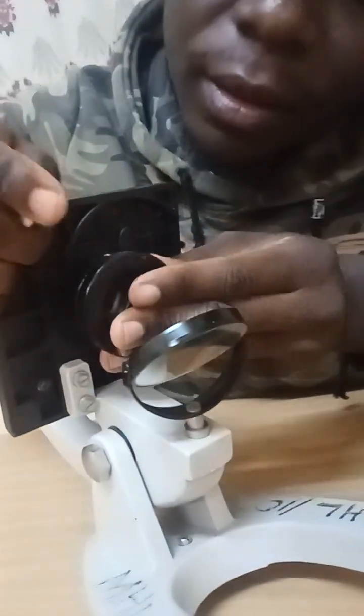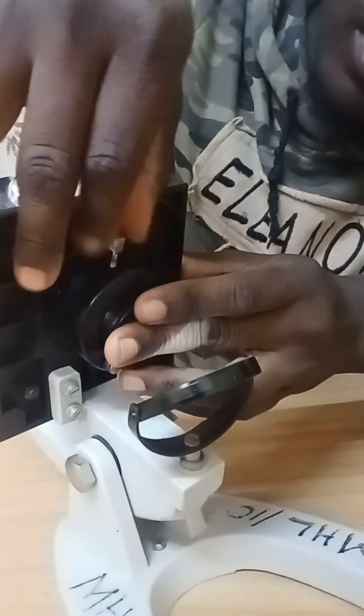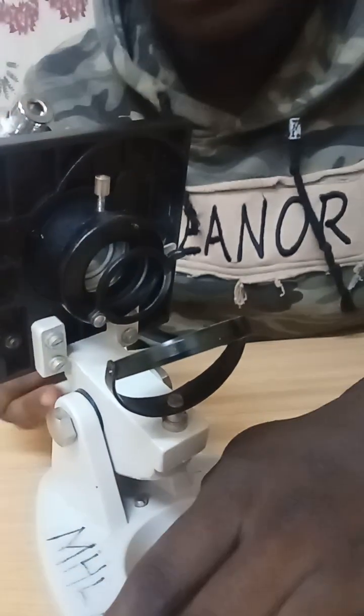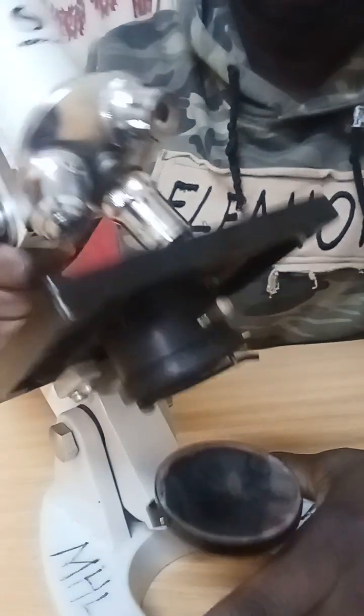Then we have our condenser here, and the role of the condenser is to concentrate light onto the object on the stage. That's why it is found just near the stage. You can take it back. So those are the parts of a microscope and their functions.